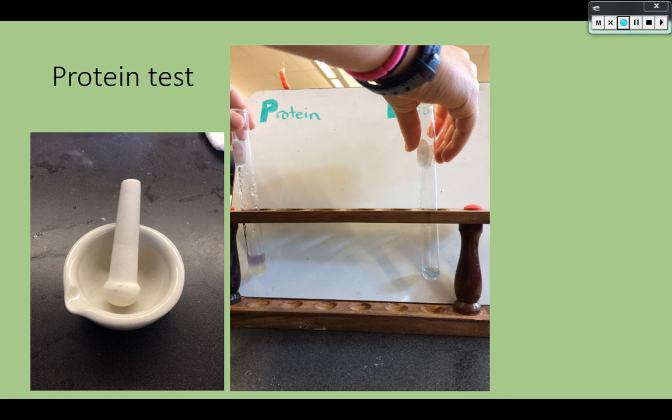And you'll notice I've done all of this against a nice white background. I'm using a whiteboard just so I can really make sure of the color. Against the dark lab tables, or against the chaos of a classroom, it can sometimes be hard. So this is where a whiteboard or even just a piece of paper comes in handy.